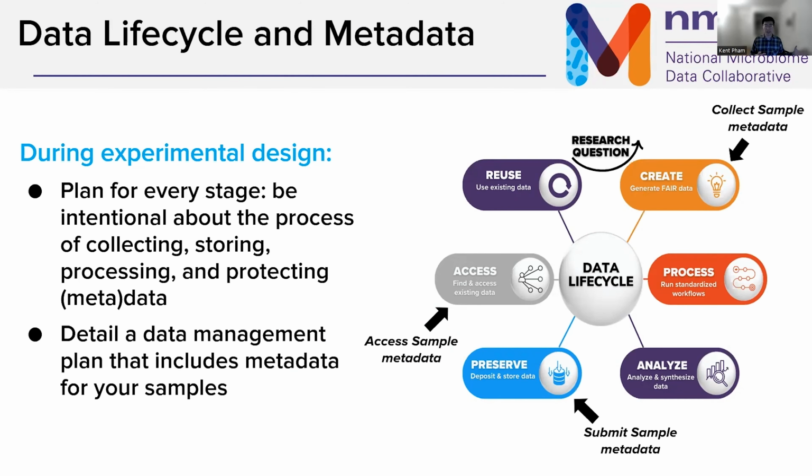So I've given you guys a background on what metadata is, and now I'm going to transition into taking care of the metadata from the collection stage all the way through your project. Now, metadata capture and storage isn't over as soon as you collect your sample. It's something that is constantly evolving, and you need to be cognizant of it the entire time you're working with your data to make sure that things aren't lost.